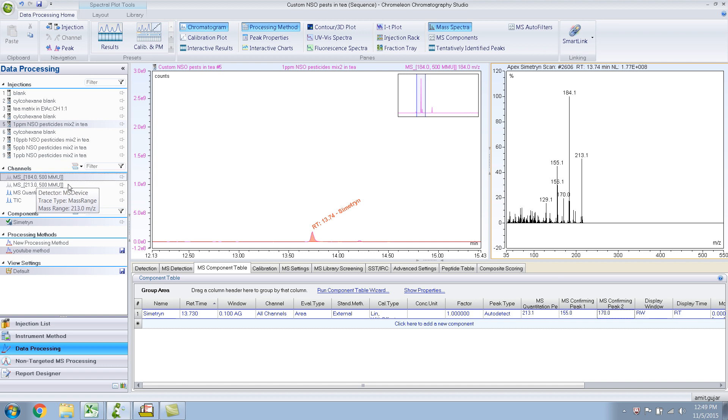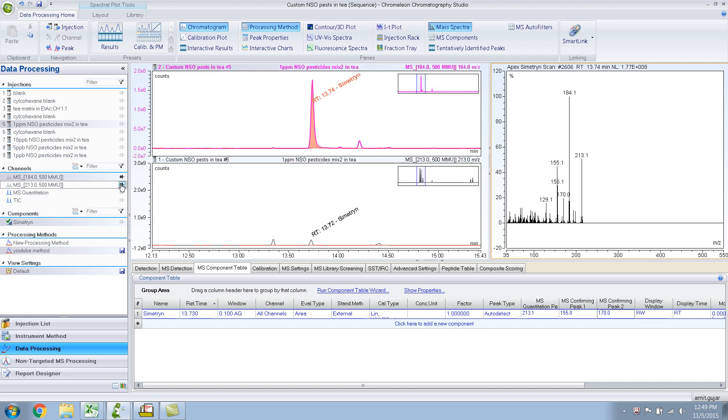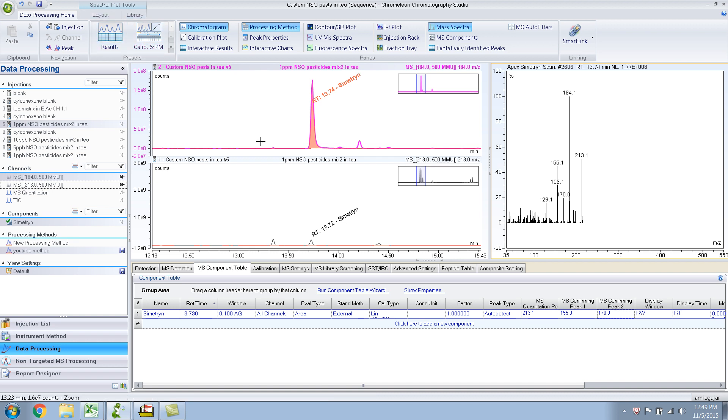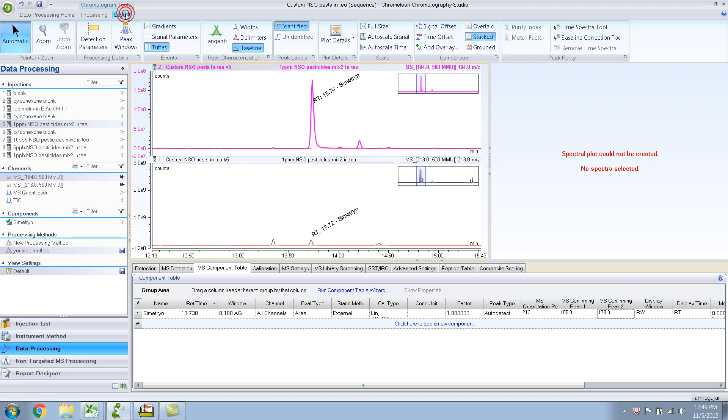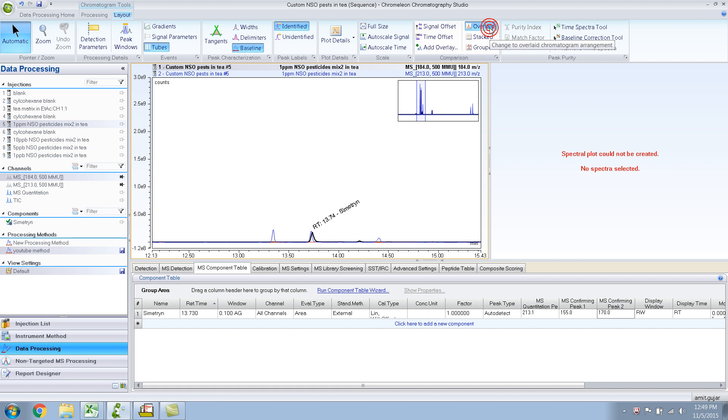And let me overlay it with 213. This time I want to overlay, so go over here - you always need to go to the chromatogram pane layout and overlay.